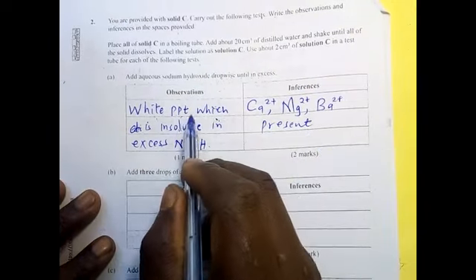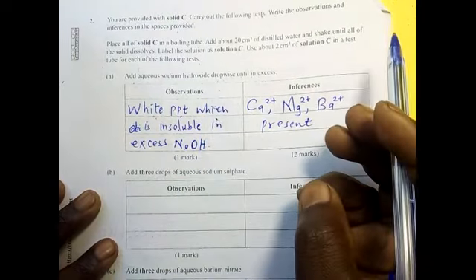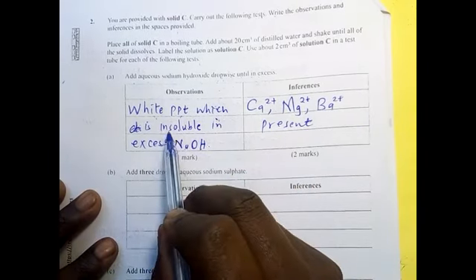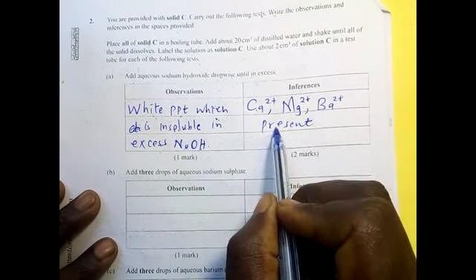If the white precipitate dissolved to form a colorless solution, then we know the amphoteric ions are there: aluminium, lead, and zinc. But since this one is insoluble in excess, it means that calcium ions, magnesium ions, and barium ions are present.